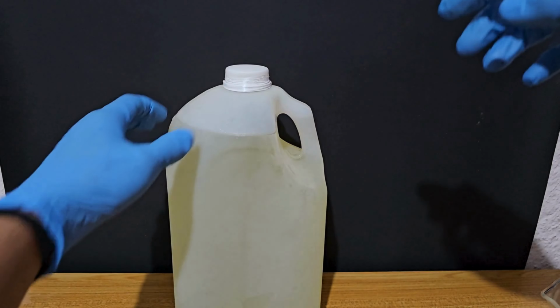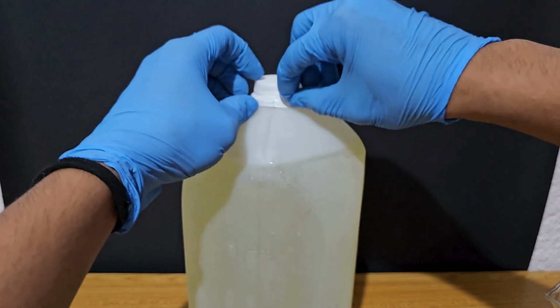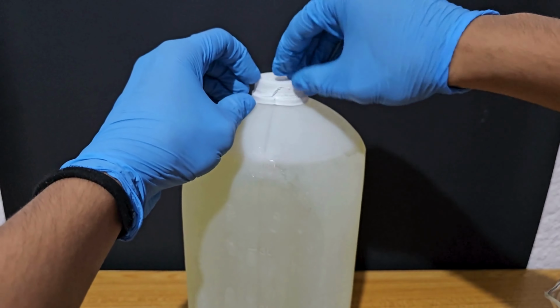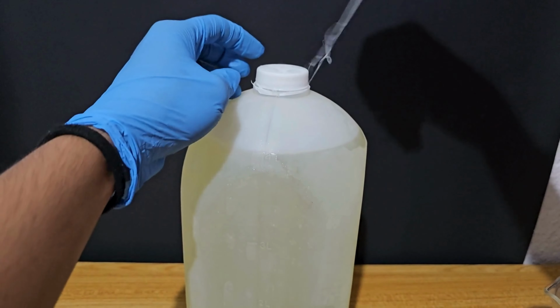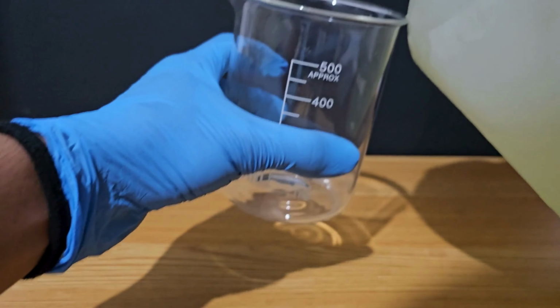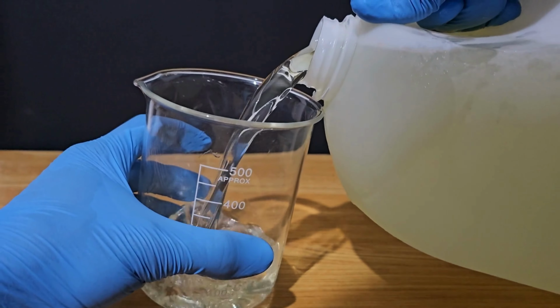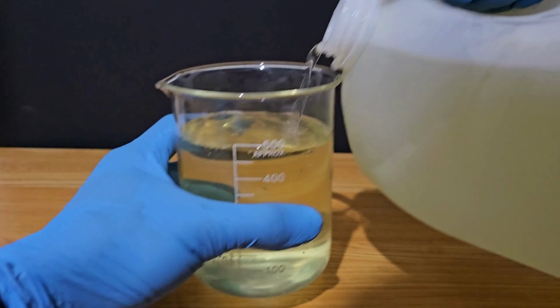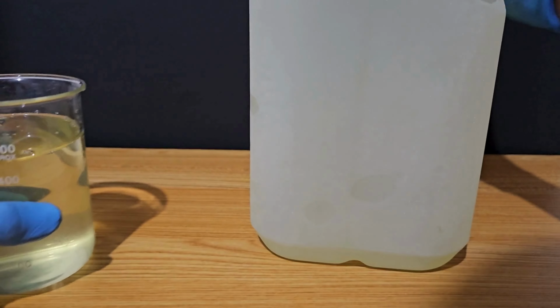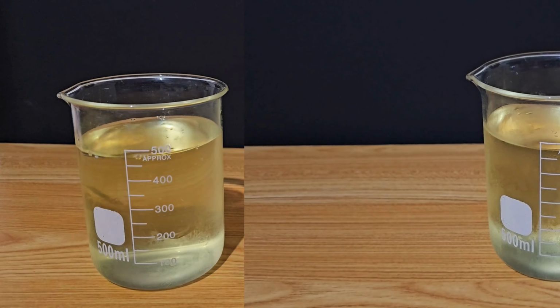First, I let the 4 liters of sodium hypochlorite solution cool in a freezer for one night, or till the temperature is below 0°C. It's very important to be below 0°C because the reaction we are going to perform is extremely exothermic and the product is very volatile. I poured approximately 500 ml of the solution in a beaker to have more comfortable mixing.